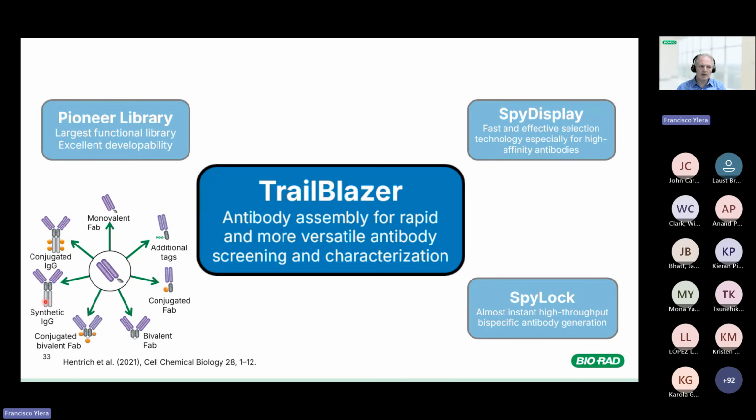But we can also convert all the antibodies in this into the synthetic IgG format. And here we have all kinds of Fc catchers, IgG1, 2, 3, 4, IgA, IgM. So we can take the whole output and within 1 hour convert it into the synthetic IgG format and continue our screening and characterization. So it's not the final drug format. It's just a prototype for accelerating the characterization of the antibodies before we then, for most projects, go into the IgG format.